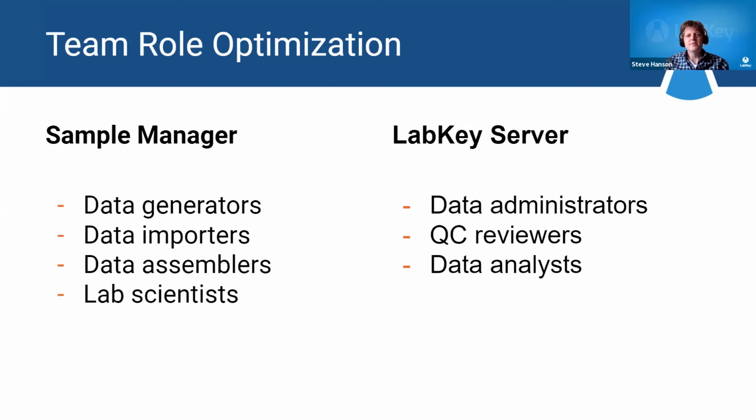Whereas LabKey Server is really optimized for data administration, QC reviewers, quality control reviewers, data analysts, queryers of the data, explorers of the data, and also for people that are building portals into the data, portals that are designed for, say, the general public or for some other team out there.